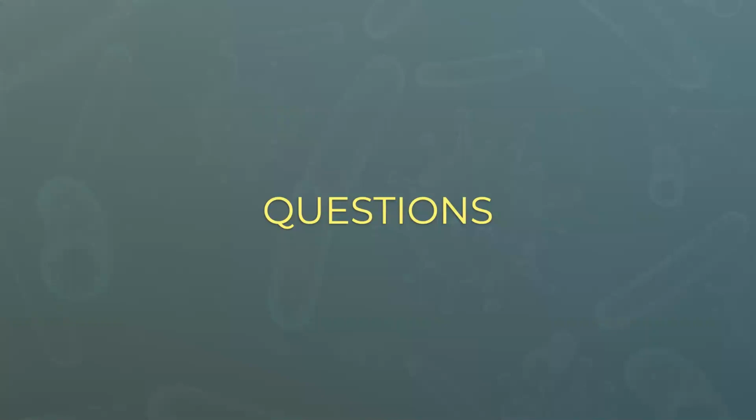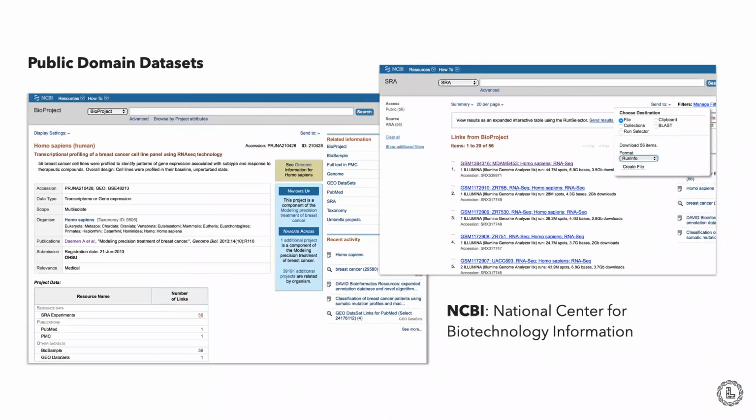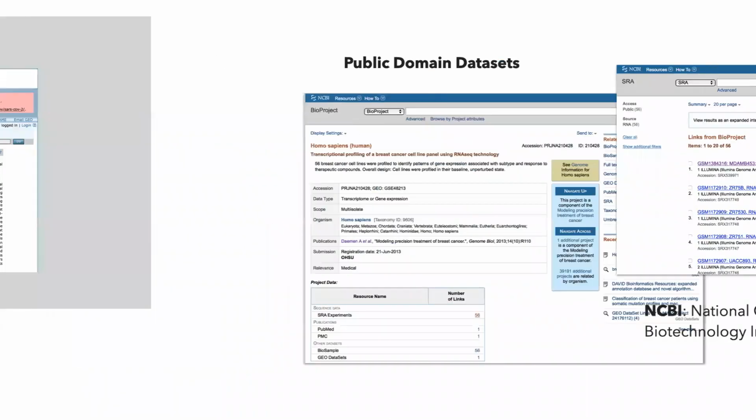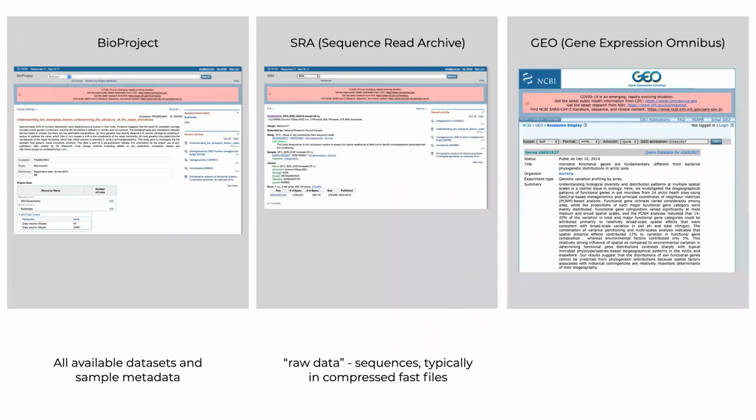Okay, so the other thing that we did last time is we looked at how to find data sets from NCBI. And we looked at 3 different types of data that you can find. We looked at bioproject data, SRA, which are the raw sequencing files that you can map onto the reference database and then quantify, or you can actually get some processed data like tables, something that you also already get as a normalized output.